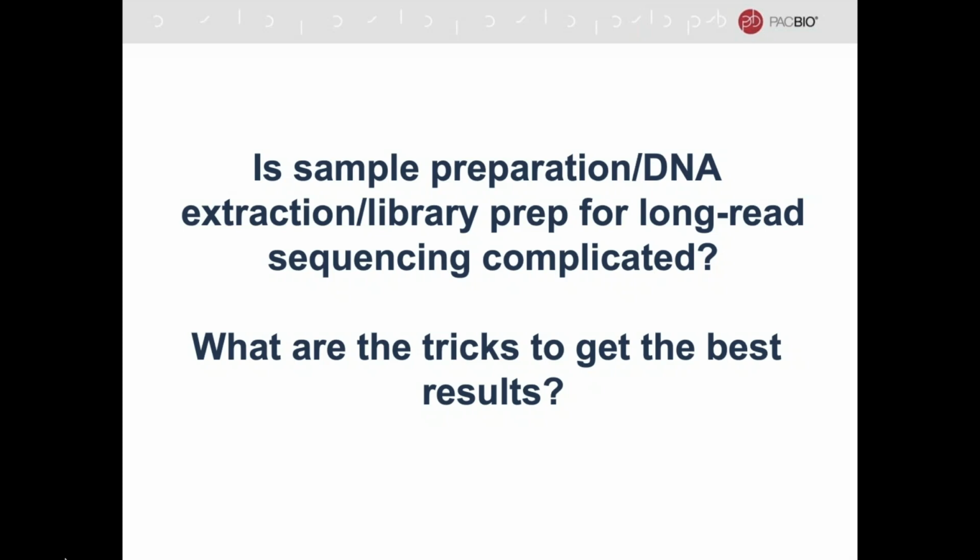So in some of the cases, you have to go to the old school molecular biology, the way we did it in the 80s and 90s, when you extract really good high molecular weight DNA. But speaking again of tricks, if you're working with plants or anything with high sugars, extracting nuclei is an excellent way to go, and then to extract DNA from nuclei directly.